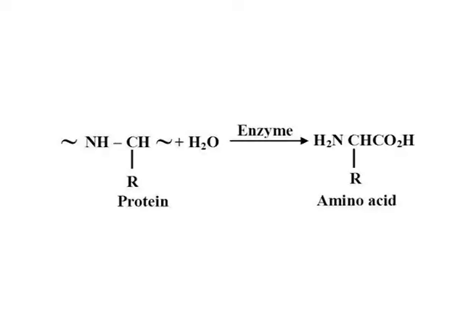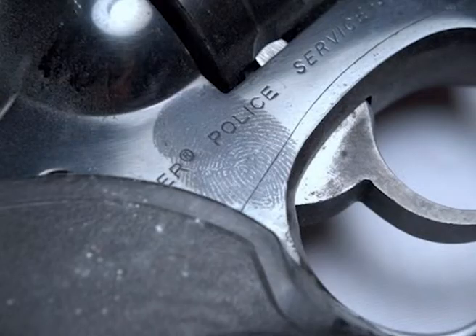Initial attempts to pre-treat the fingerprint samples proved futile because the enzymes were dissolved in non-aqueous solvents in which they denatured. Subsequently, however, the dusting of powdered enzymes before the Ninhydrin treatment was tried. This gave pronounced enhancement of latent finger marks, especially those that were 2 weeks to 3 months old. The methodology involves the following steps.